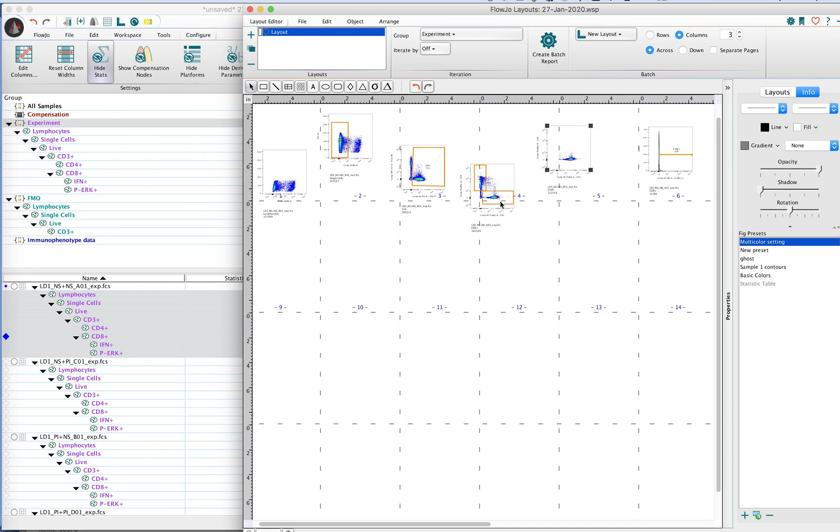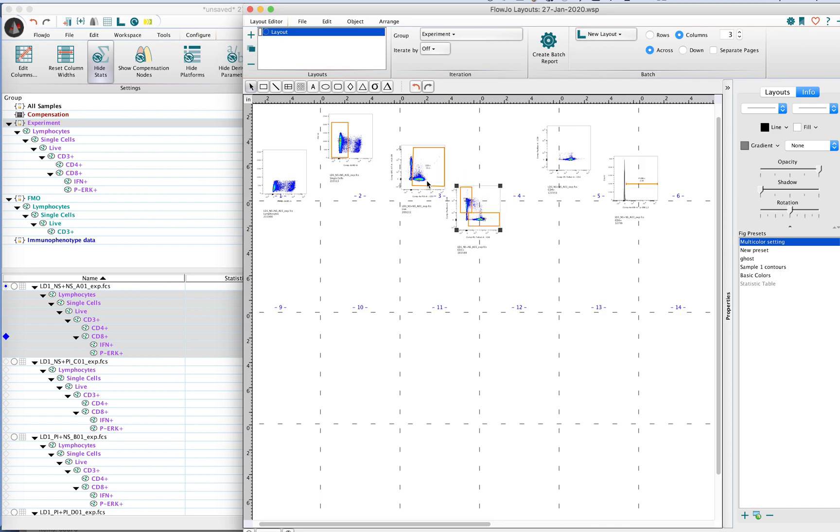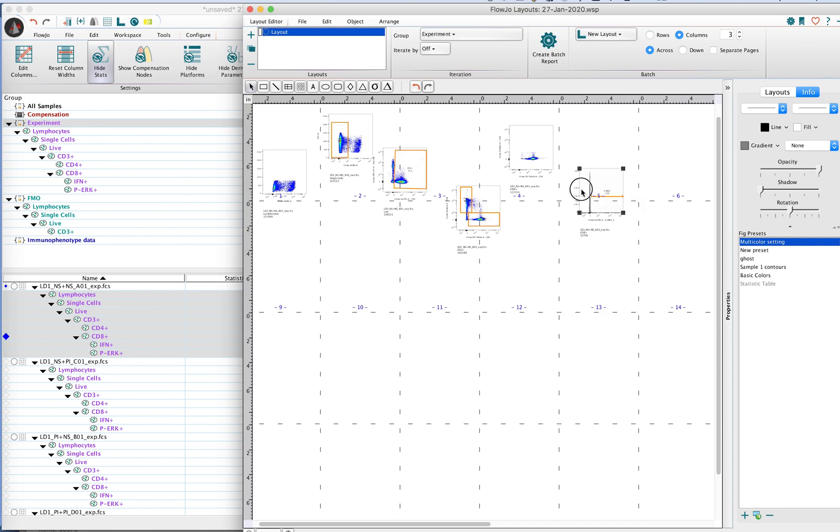Often times you'll end up moving these plots around, nudging them one way or the other, and you may end up in a scenario where you've got a bunch of plots that are scattered throughout the layout editor in different positions and nothing looks nice and orderly.